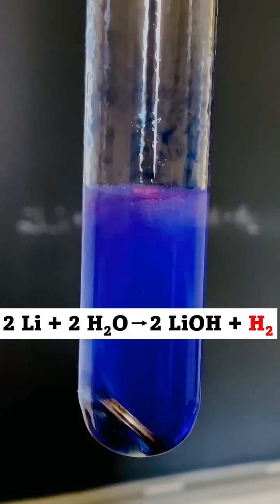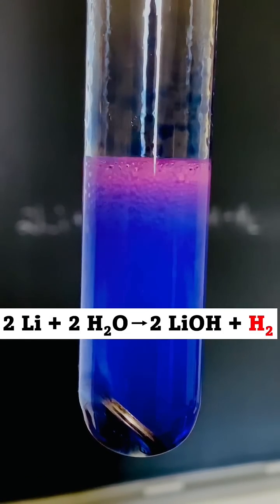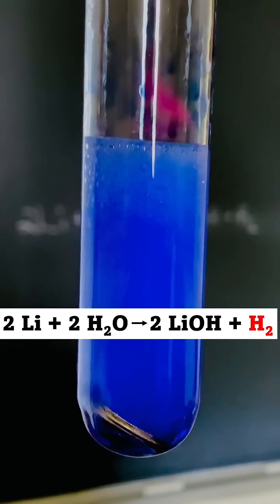Lithium also produces hydrogen gas when it reacts with water. Let's try to ignite these bubbles to see if it's hydrogen. Those bubbles are hydrogen all right. Did you notice the color of the hydrogen flame? Lithium compounds are well known to emit pink light when they're heated, so the pink flame I'm seeing here is even more evidence the battery contains lithium.